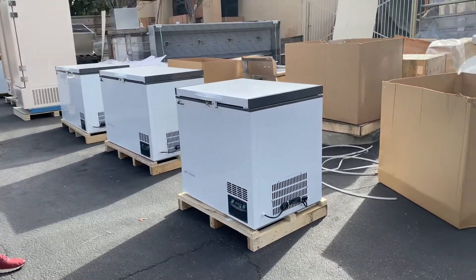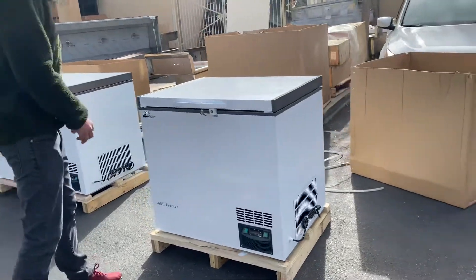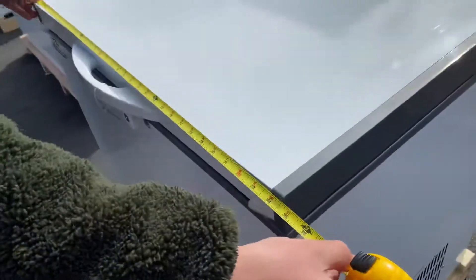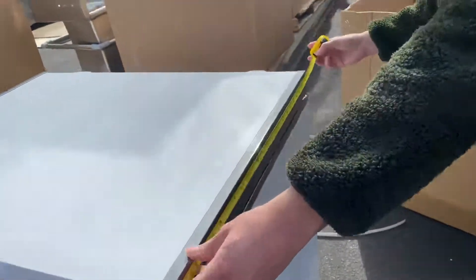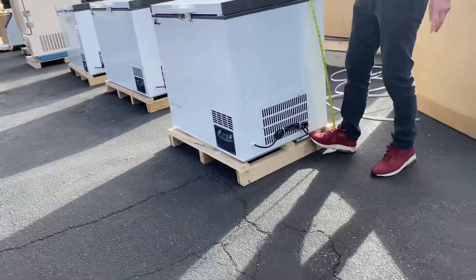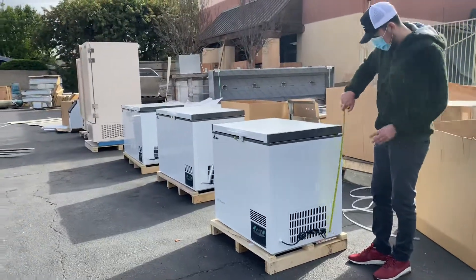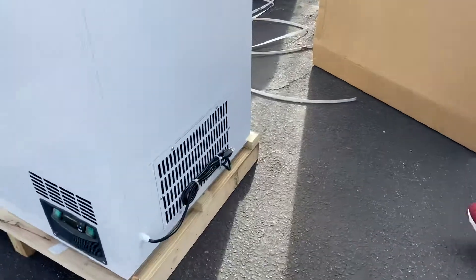The temperature for this freezer can reach up to negative 60 Celsius. For overall measurements, you're looking at 34 and a half inches in length, followed by a depth of about 29 inches, and an overall height of about 34 inches.